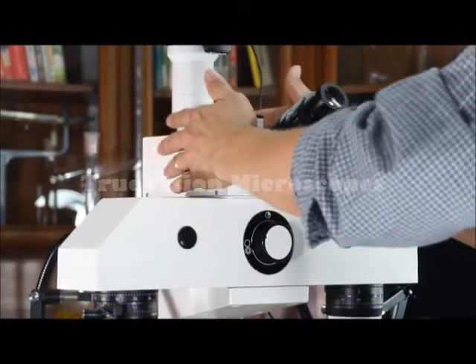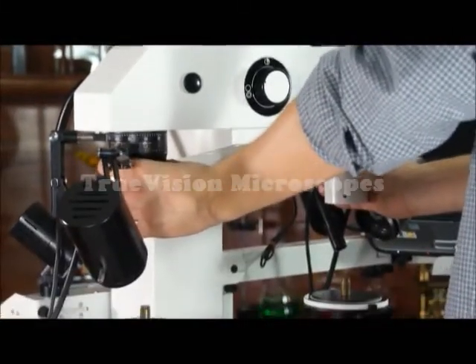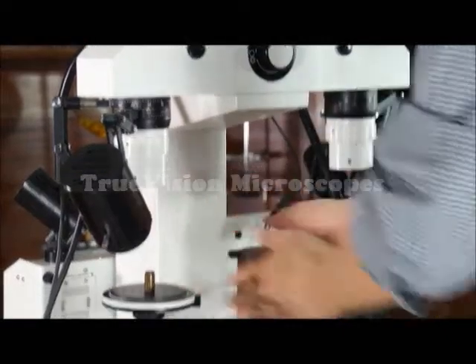So we have the head, we have the bridge, we have the zoom objectives, we have the frame, and we have the stage.